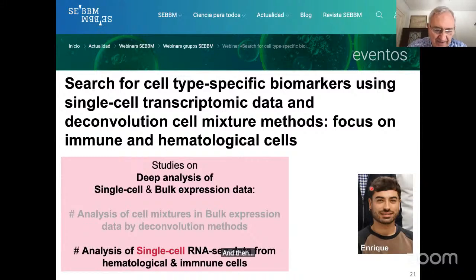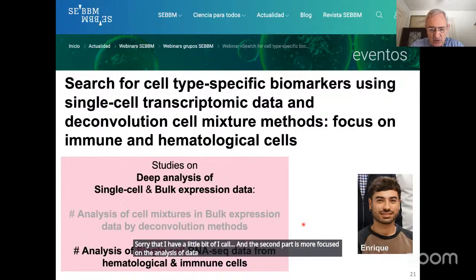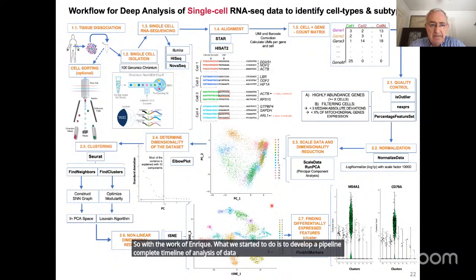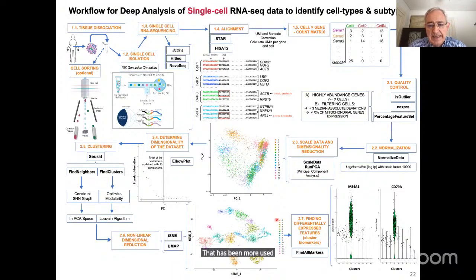Sorry that I have a little bit of a cold. And the second part is more focused on the analysis of single cell data. So with the work of Enrique, what we started to do is to develop a complete pipeline of analysis of data from samples of single cell data, mainly focused on 10x genomics, because 10x genomics is the technology that has been most used to obtain the single cell plots.